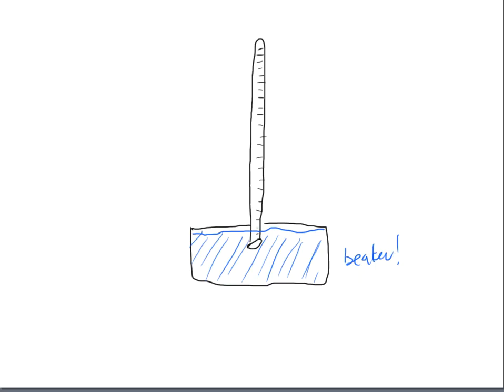Over here to the side, I'm going to take my eudiometer when I grab this in the lab, and I'm going to fill that eudiometer full of water all the way to the tippity top. All the way to the top. I do not want any air bubbles that form here, especially when I turn that piece of glassware upside down. So I will get my eudiometer, fill it all the way to the rim, and overflow it if you have to. It's just water, who cares? You're not going to make a mess.